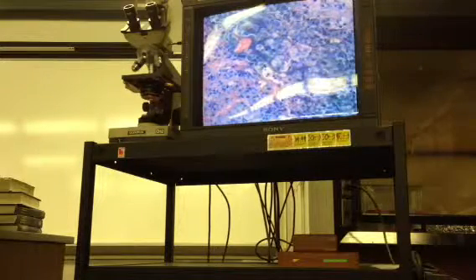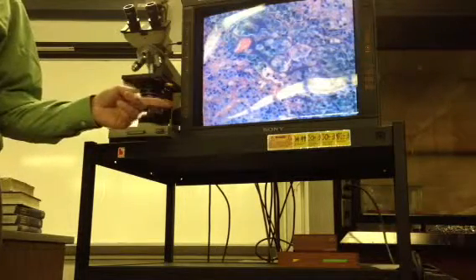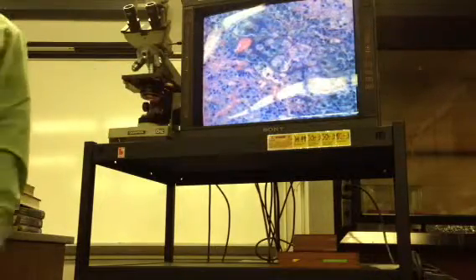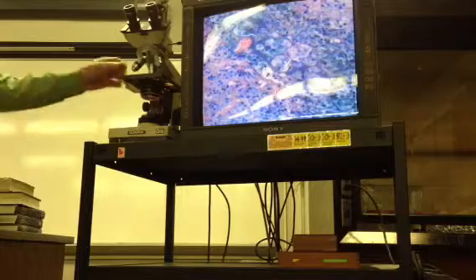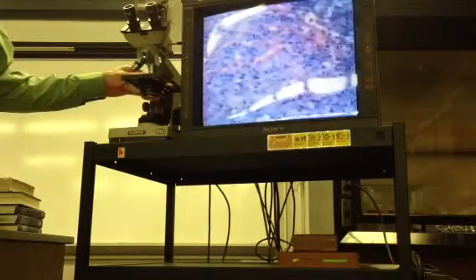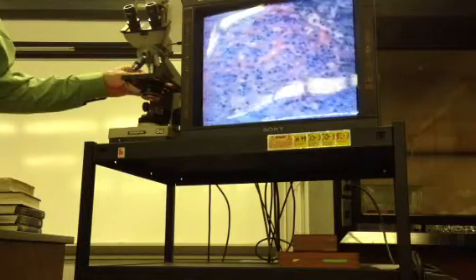Where's the border between the reticularis and the medulla? It's just the border between pink and green. So where's the border between the fasciculata and the reticularis? That's a little tougher to distinguish. If you look here, it looks like it's almost all fasciculata. It's where you start getting bulging up here. The reticularis here is just this thin band. Okay.